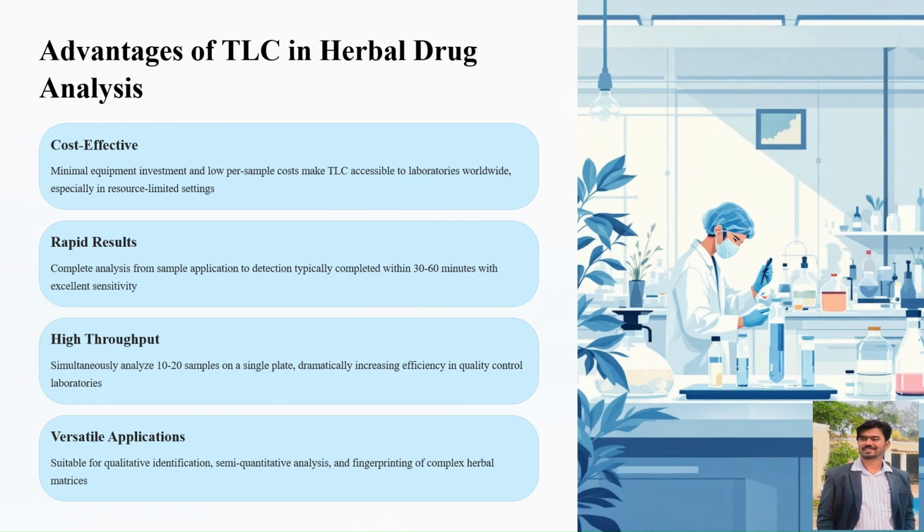So rather than HPTLC, we can use TLC. Otherwise, it gives rapid results. In the case of HPTLC, we require a very trained person. In the case of TLC, anyone, any student, can use it very easily.